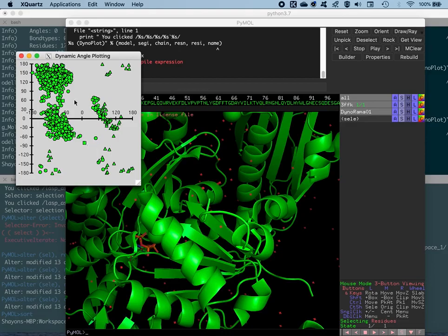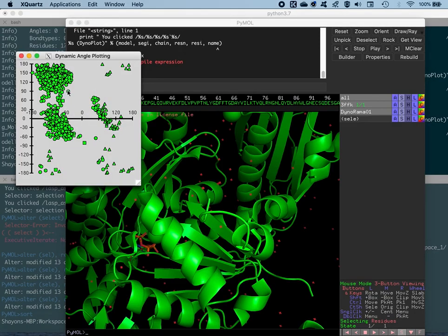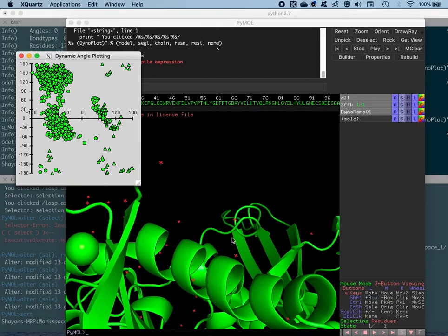Let's try the same with, let's say, another amino acid residue, something else like the circles here. So if we right click on this one, it will further locate to a region. We right click on this one, it'll further go down here, which is basically another loop region somewhere here. Okay, so this is another residue apart from the glycine or proline in another loop region.